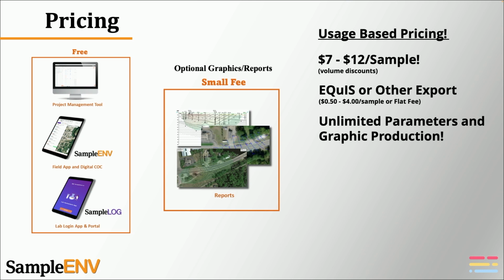If you've opted into the reporting, all historical data is uploaded for free. Let's say your project has 40 years of data. We go by the day you started the project within the platform, and any data and samples collected prior to that date can be uploaded at no cost. We only charge for samples going forward from the day you start the project. The reporting functionality will be available on both new samples and historical samples if you've opted into the reporting.